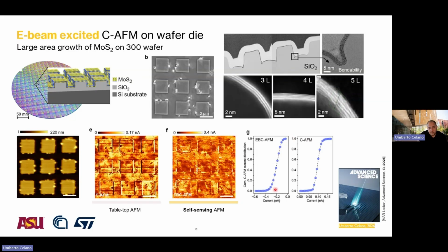Also, if you look at the current distribution, you will see that there is nothing really funky between these two measurements. In other words, most of the differences here come from the quality of our amplifier and our probes in this case, but not necessarily from the physics governing the acquisition. I do believe the physics governing the acquisition is perfectly identical in these two situations.